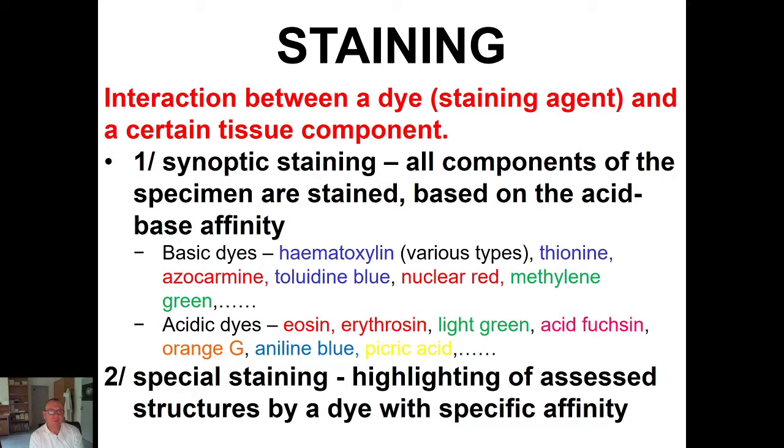to certain tissue components. If we use a combination of dyes in order to stain the whole specimen, the staining is called synoptic.